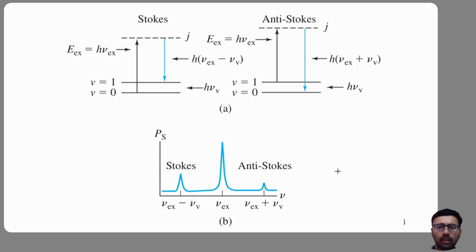Now let us examine the actual energy exchange process. This is one of the most important concepts in Raman spectroscopy. Suppose we illuminate a molecule using a monochromatic laser. The incoming photons possess energy E equals h nu, where h is Planck's constant and nu is the excitation frequency.